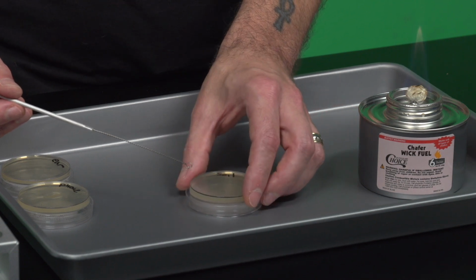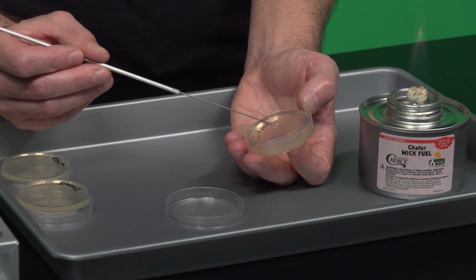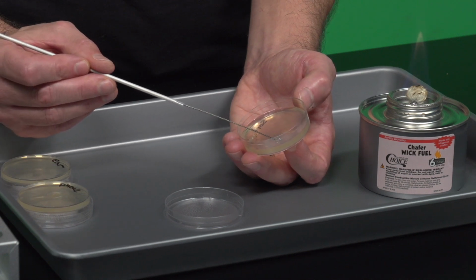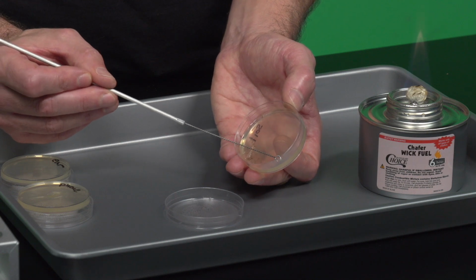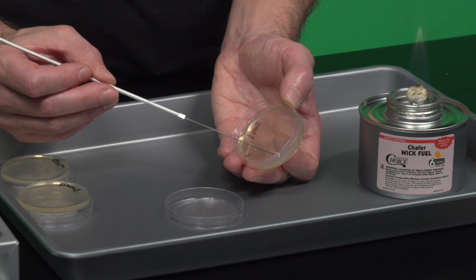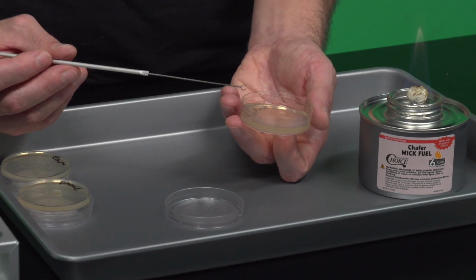Another way to test if it's cool, or to cool it down a little bit more quickly, is you can find an area of the media that you've not inoculated and you can just gently touch it with this, and the coolness of the media will help cool down the loop. Okay, you would only want to do that with the sterilized loop.